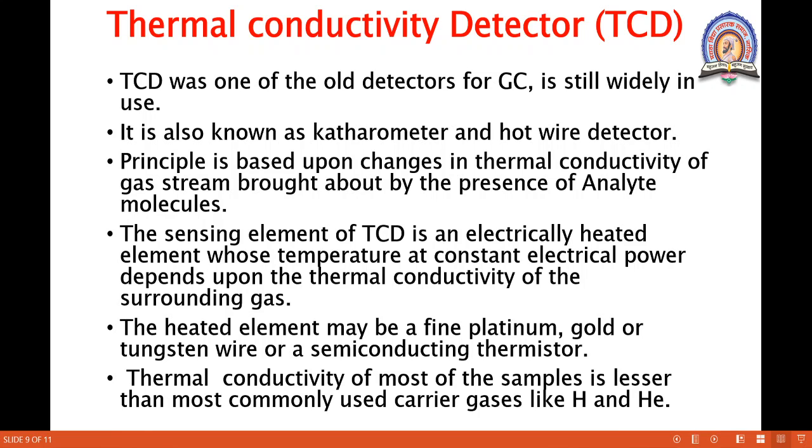The heated element may be a fine platinum, gold or tungsten wire, or a semiconducting thermistor.